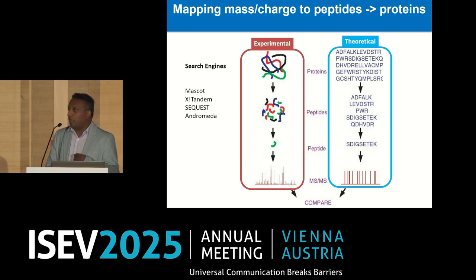In the theoretical one, the peptides are fragmented from a protein, let's say, using an enzyme called trypsin, and trypsin normally cleaves at the C terminus of arginine or lysine. So you create theoretical peptides ending with R or K, and then analyze the MS-MS spectra for each one of them. You compare your experimental MS-MS spectra and your theoretical MS spectra, match the best, and then score them, and whichever scores the highest, you will identify as your protein of choice.